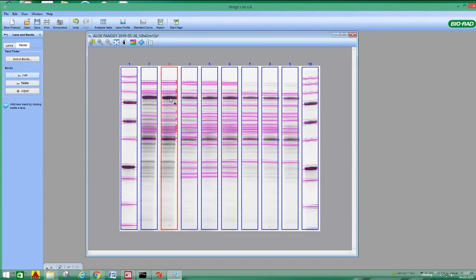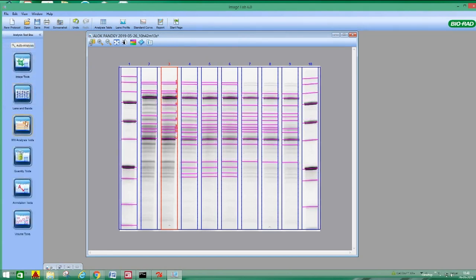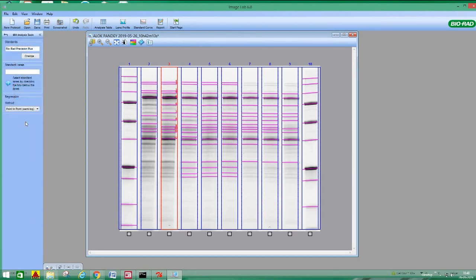Okay, this way you can do. So you can add also. After being done with this, we have first detected the lanes, and second we have detected the bands. Now it's time for the calculation of molecular weight analysis.